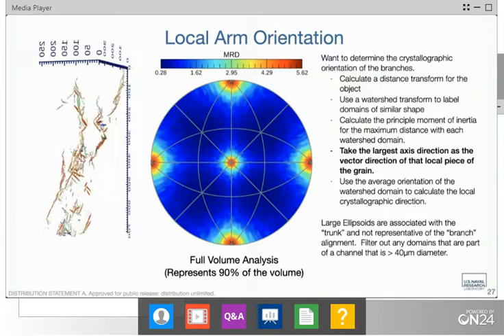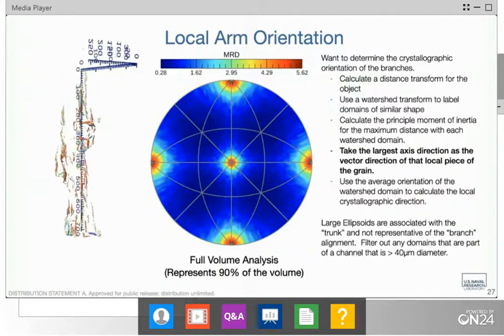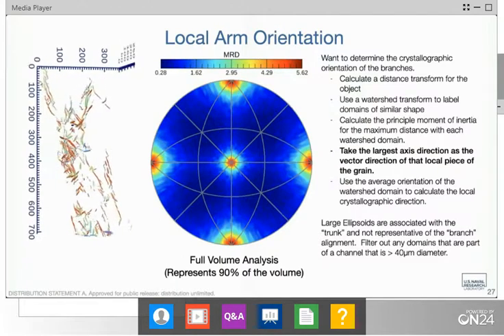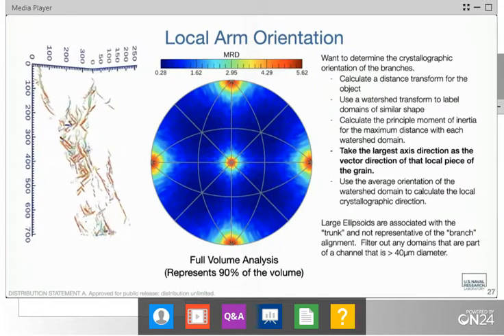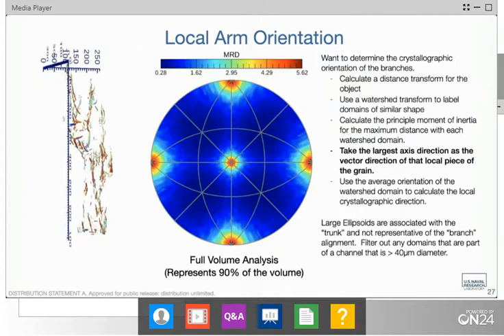The question is how can we index or measure accurately acicular ferrite, carbide-free bainite, and lath martensite, as these all belong to the crystal structure of BCC and BCT.